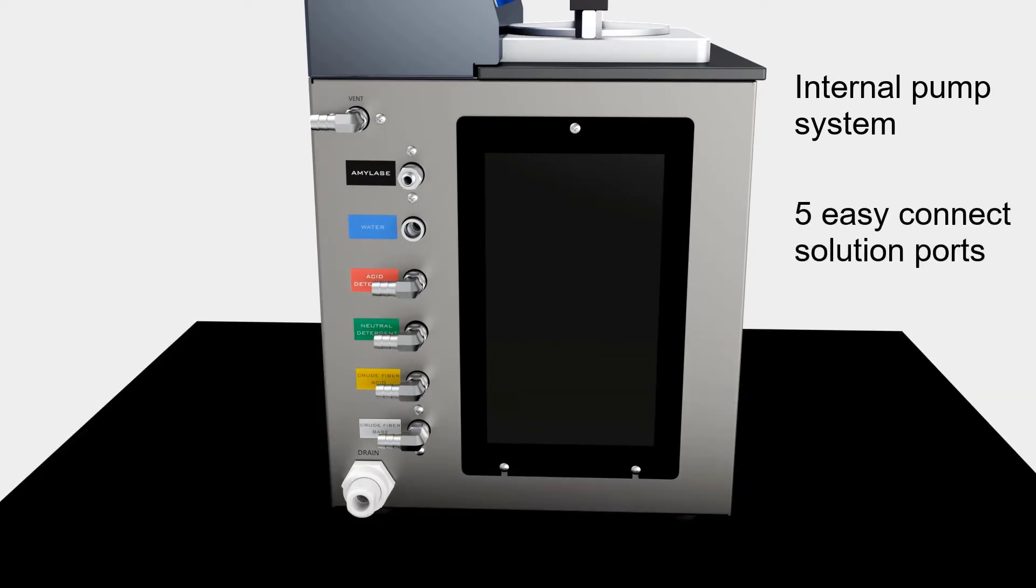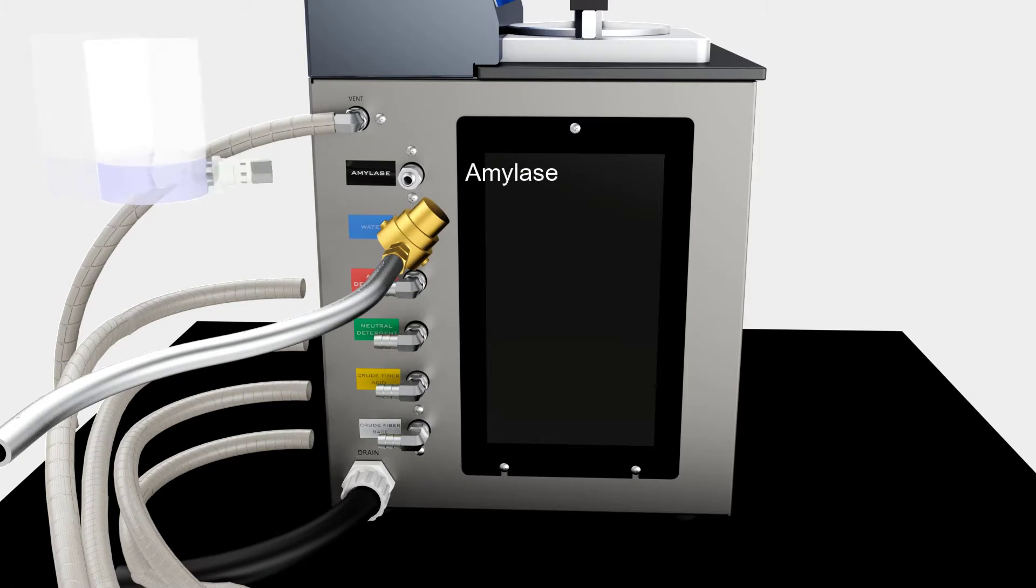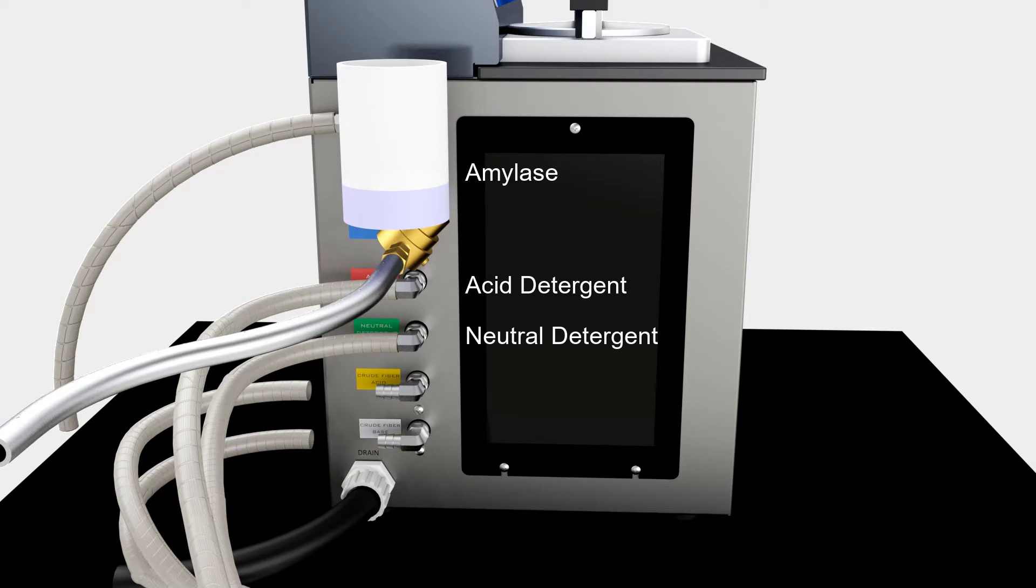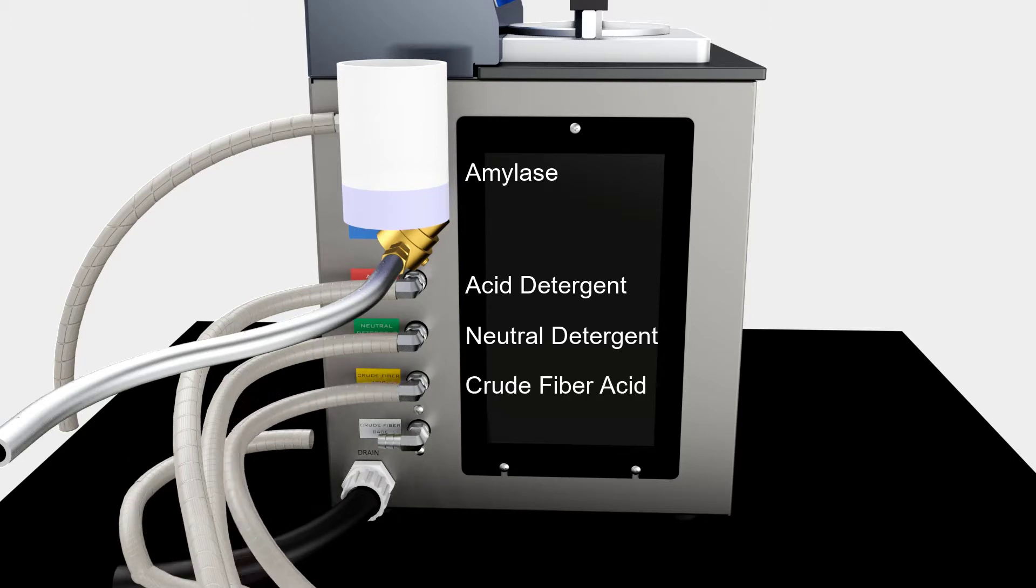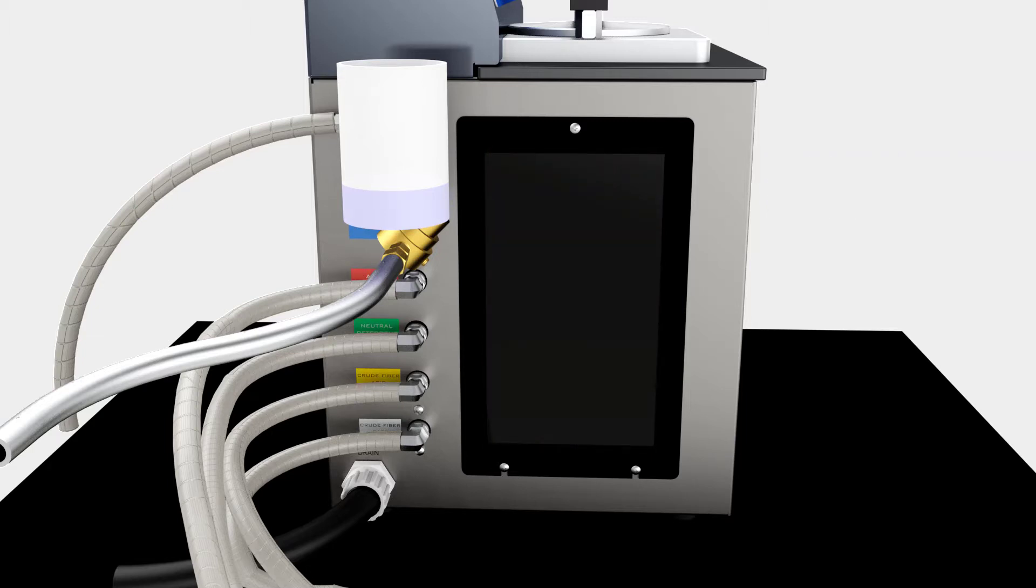Five easy-connect solution ports include amylase acid detergent, neutral detergent, crude fiber acid, and crude fiber base. The addition of a transparent side access panel simplifies periodic maintenance and allows the user easy visual access to the internal pumping system.